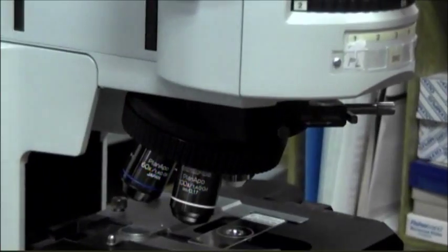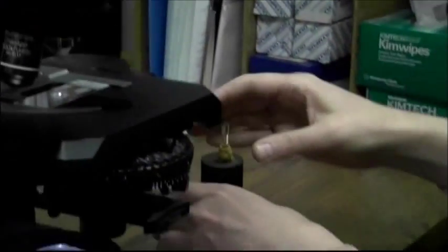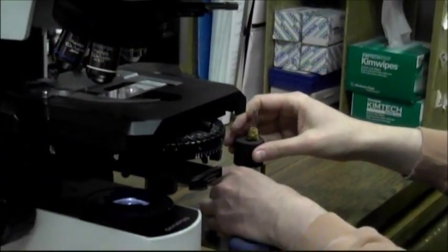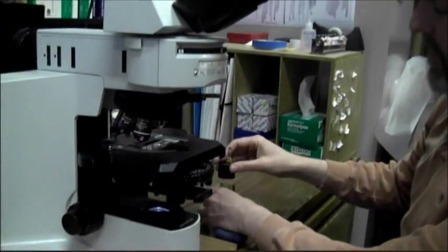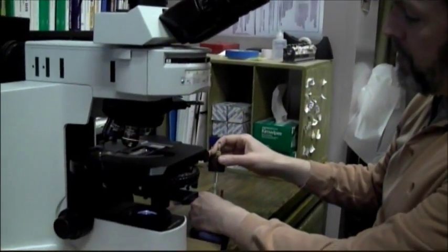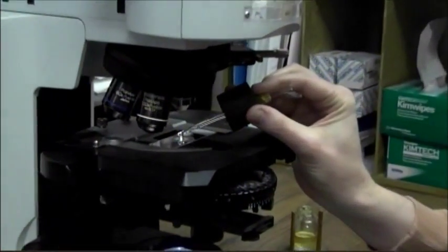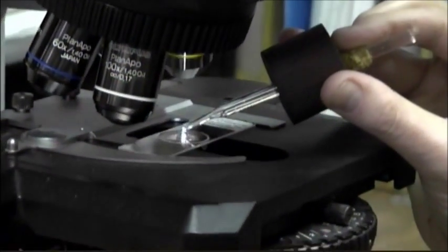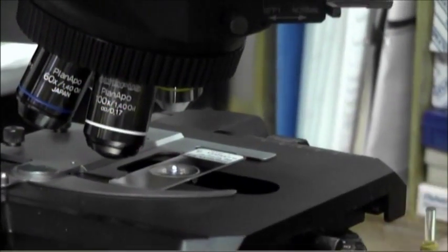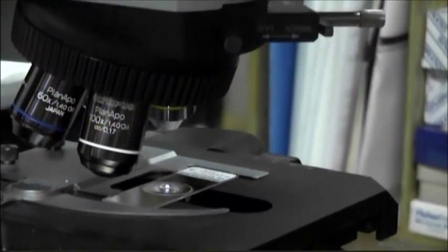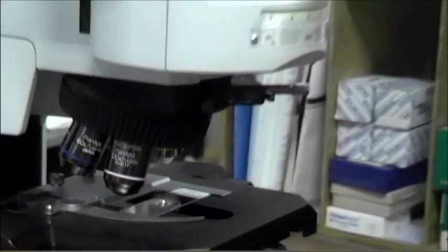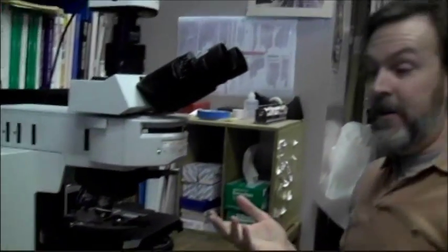And here I'm using standard light microscopy at a thousand times magnification and we use a method called oil immersion where we add a drop of highly refractive oil to the slide. And without getting into the details of the physics behind it, by adding the oil it gets rid of that air space between our sample and the lenses and that really increases our resolution.